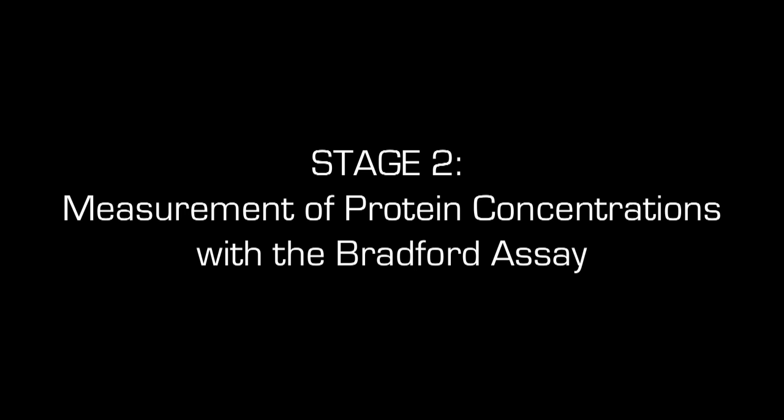In this video we demonstrate how to perform the Bradford assay to measure the concentration of protein in the cell and tissue lysates to be analyzed. The concentrations are necessary to ensure that equal amounts of protein from each sample are incubated onto the antibody microarray.